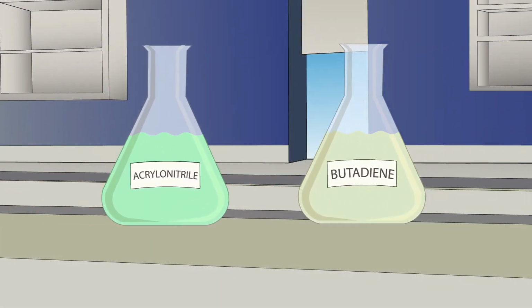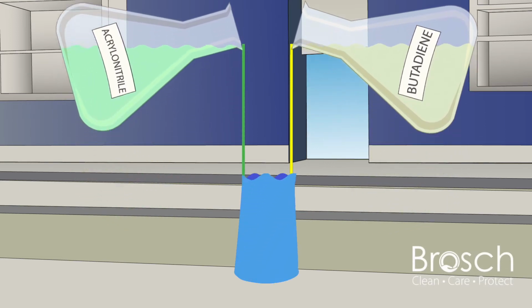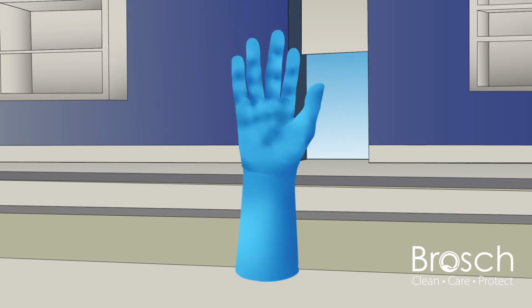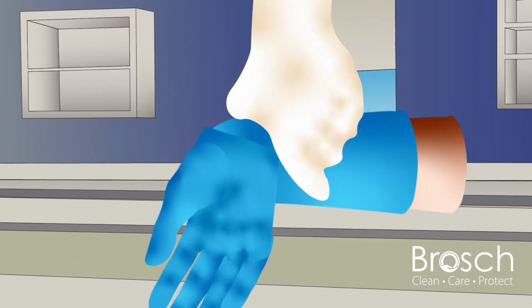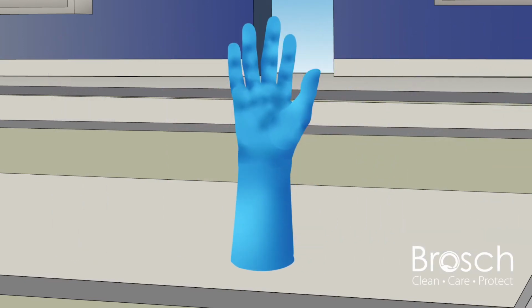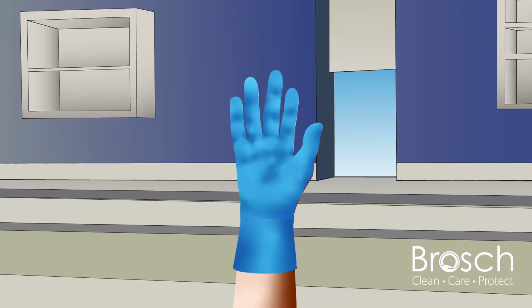Nitrile gloves are made from synthetic rubber, made up of butadiene and acrylonitrile. The gloves themselves can be disposable, thinner film, or reusable, thicker film. Nitrile is an excellent alternative to natural rubber latex gloves because it doesn't contain the latex proteins that are known allergens.